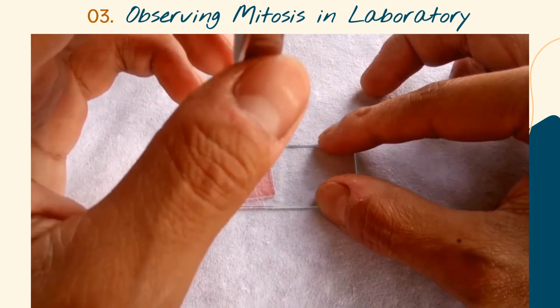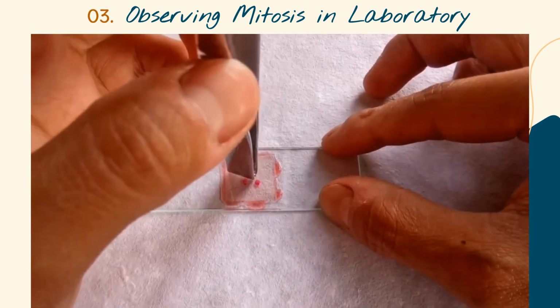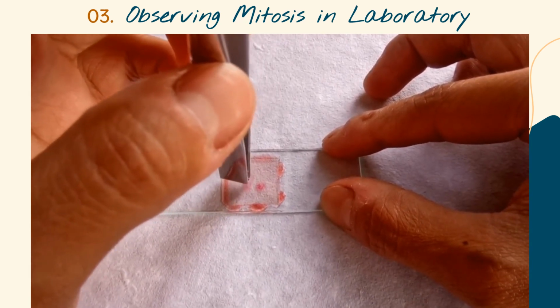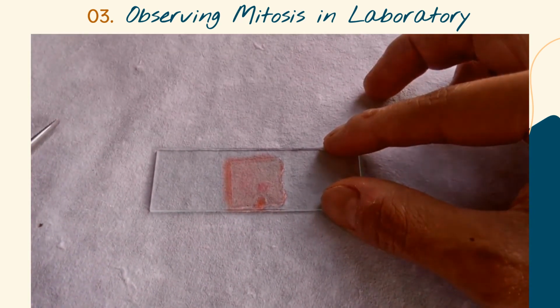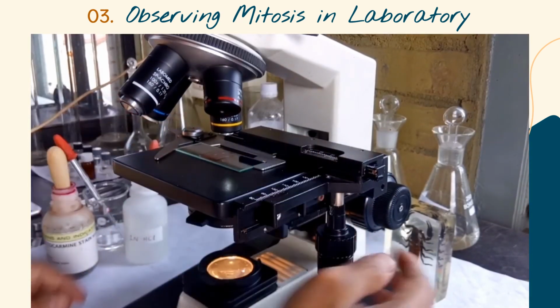Using the blunt end of a forceps or a pencil, gently tap the cover slip a few times until the root tips are uniformly squashed in between the slide and the cover slip. A properly squashed slide will appear faint cloudy pink to almost colorless. The root tip slide is now ready for microscopic observation.